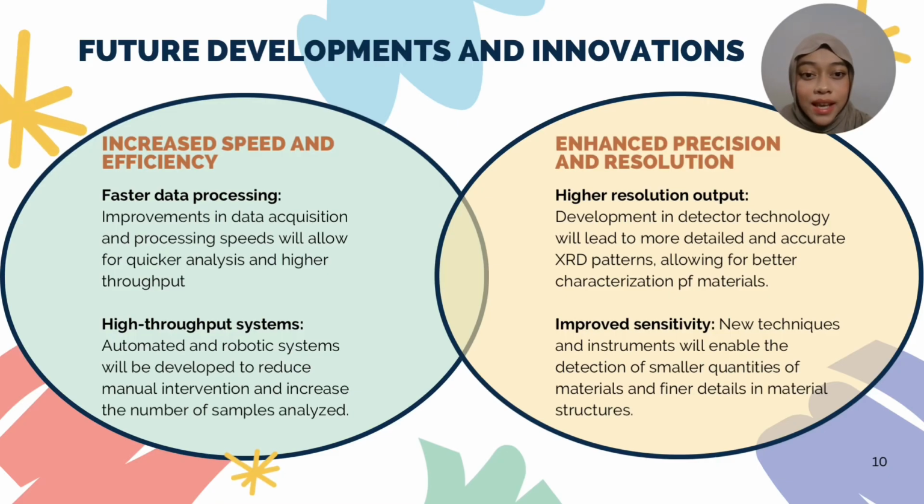Future developments and innovation. First, increased speed and efficiency, faster data processing. Improvements in data acquisition and processing speeds will allow for quicker analysis and higher throughput. High throughput systems with automation and robotics will be developed to reduce manual intervention and increase the number of samples analyzed.